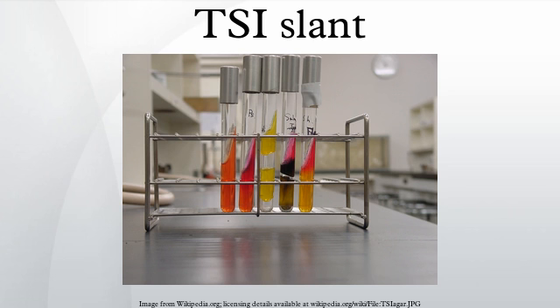A bacterium that is a non-lactose fermenter and ferments glucose initially causes a yellow slant, yellow bottom after 8 hours, but then converts to a red slant, yellow bottom after 24 hours. Whereas if it ferments both lactose and glucose, it results in a yellow tube and remains that way due to the large amount of acid produced in the reaction. Blackening of the bottom due to H2S production may mask the acid reaction in the bottom of the tube. Salmonella enterica serovar Typhi may result in blackening of the medium at the interface of the bottom and the slant.